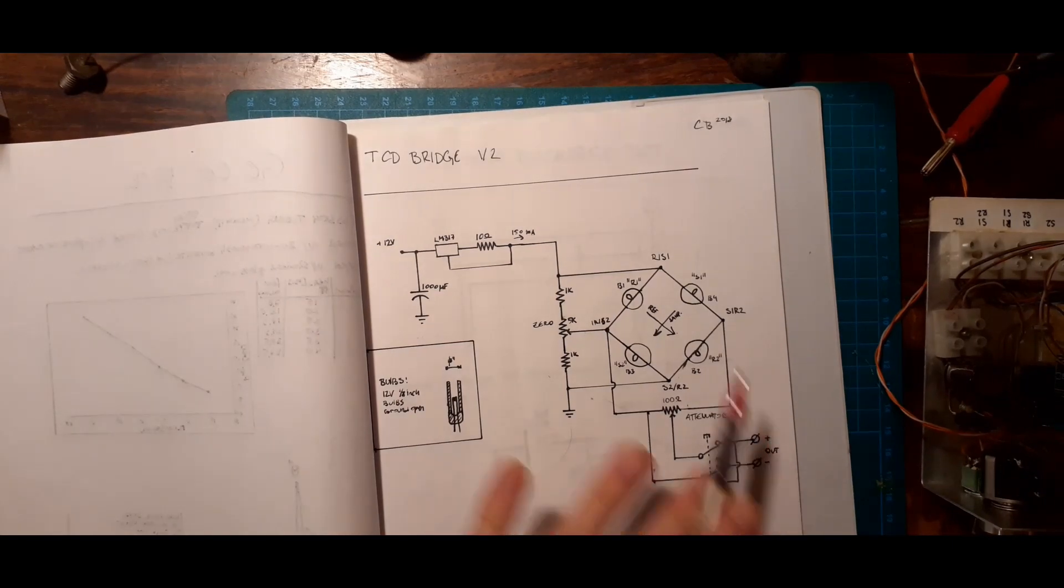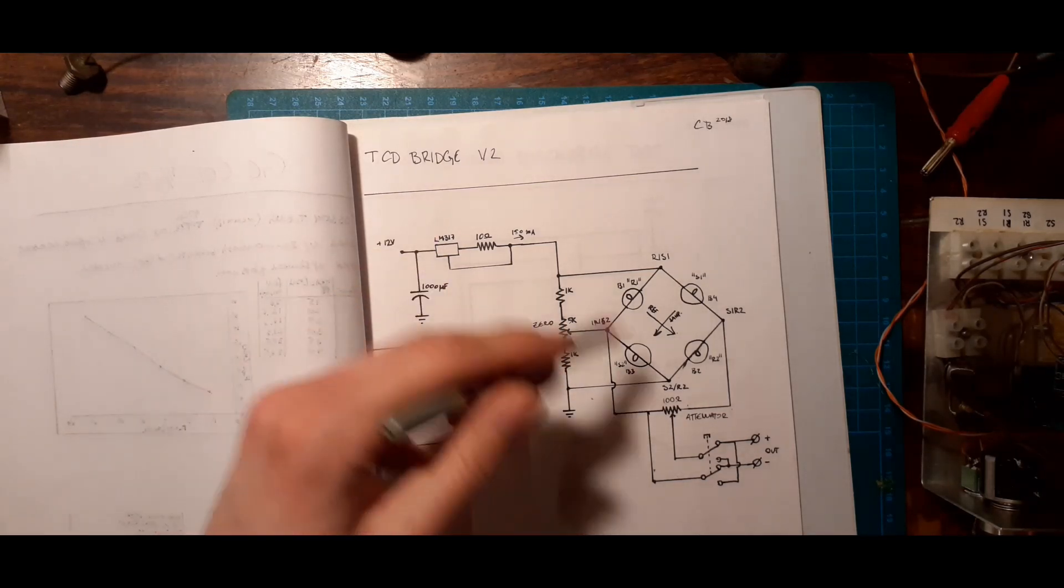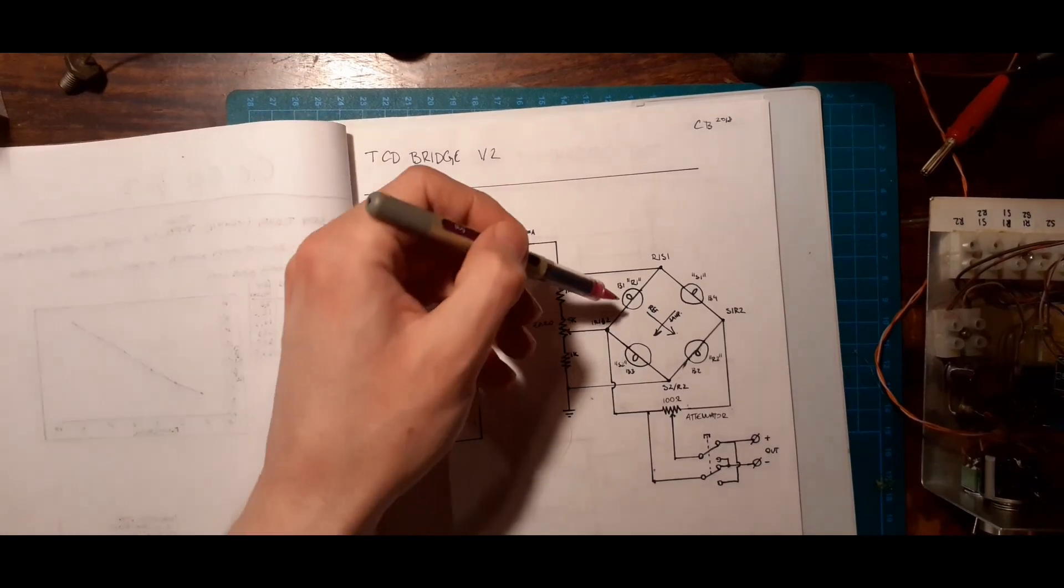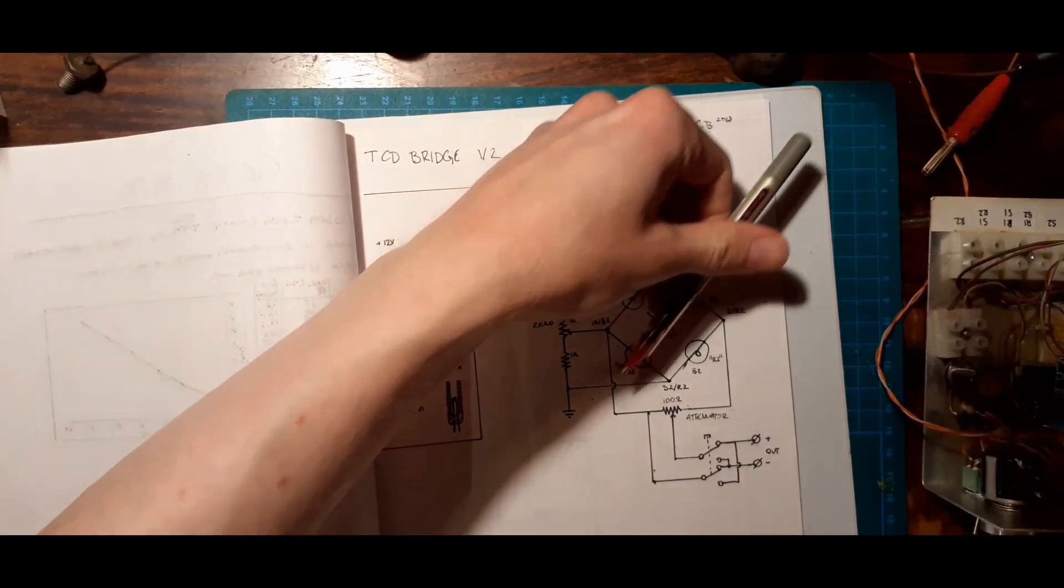This is the basic thermal conductivity detector, and it's literally just four filaments, little thin wire filaments in a Wheatstone bridge configuration here, with some additional circuitry I'll talk about in a bit. And you have two of them in your reference flow, and you have two of them in your sample flow.